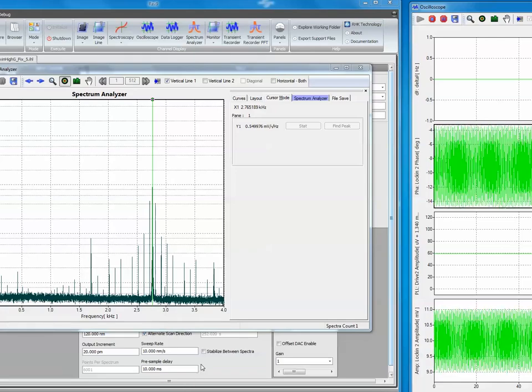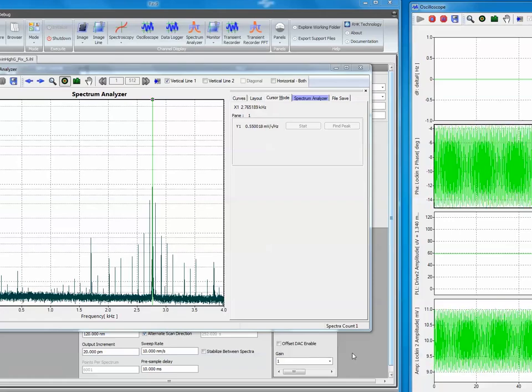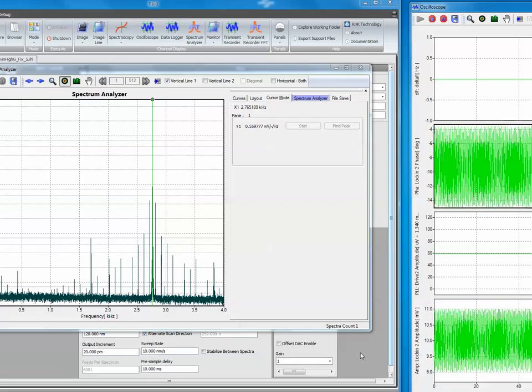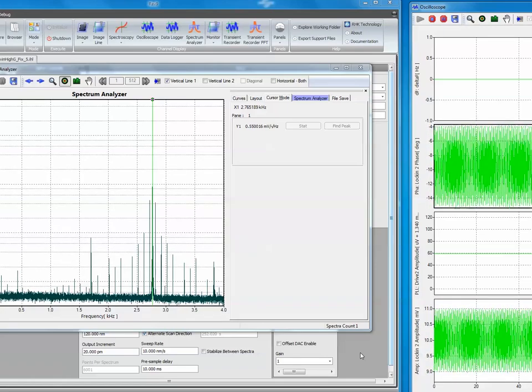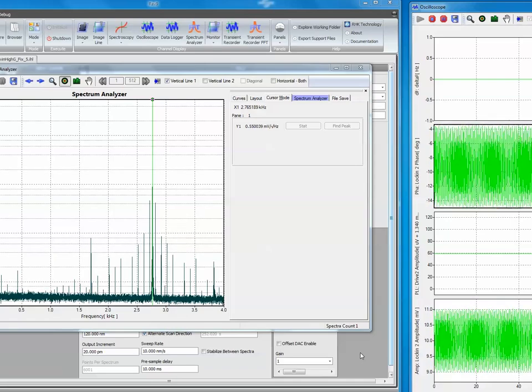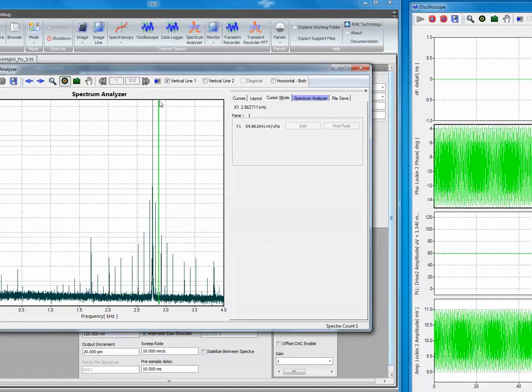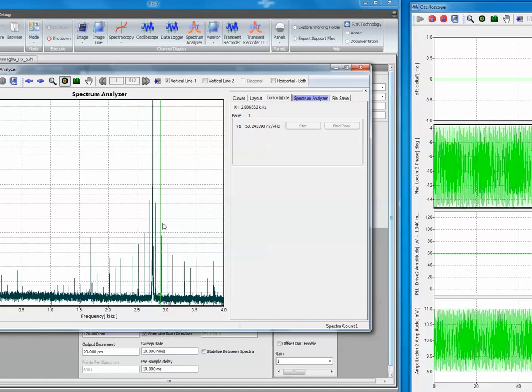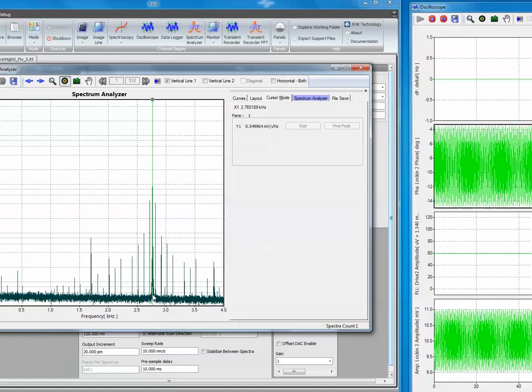In order to demonstrate the 1F peak effect, I have rigged up a quartz tuning fork on a prototype R9 system, which has about a 10 millivolt input offset at gain 1. You can see here in the spectrum analyzer already that there's a substantial peak at 2.765 kilohertz.